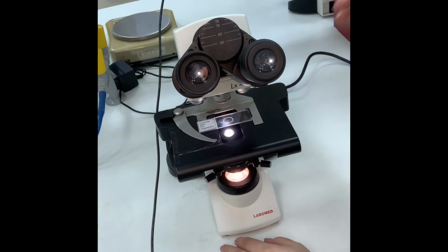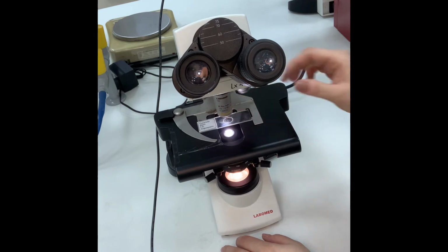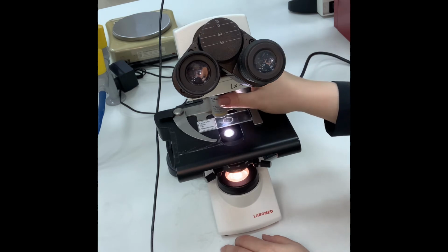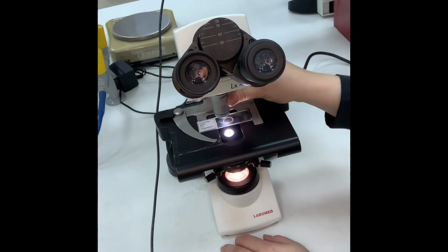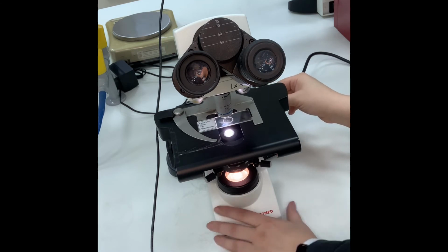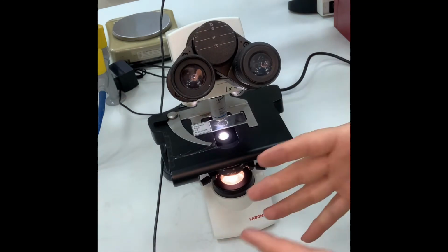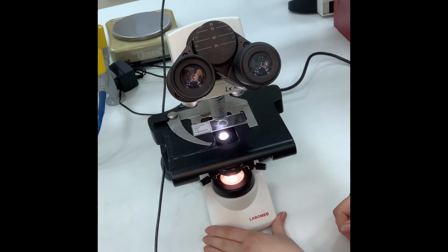And from there, you can look at the image, you can draw it, and then if you need to go for a higher magnification, very simple. All you have to do is pull the revolving nose piece and change it from 10 to 40, very freely. You can remove it. All you have to do is sharpen the image by using the fine focus, the small knob over here. Because once you go deeper, it sometimes becomes really foggy, so you will just have to focus it.